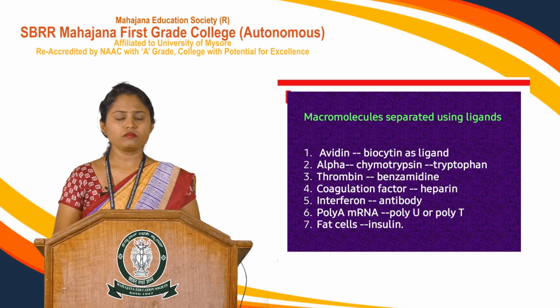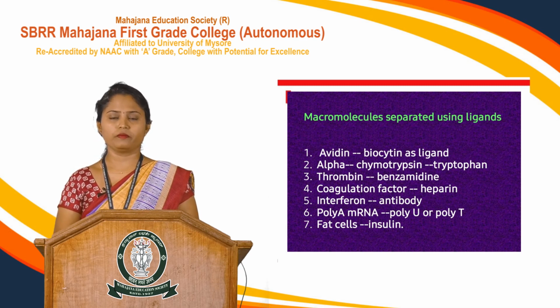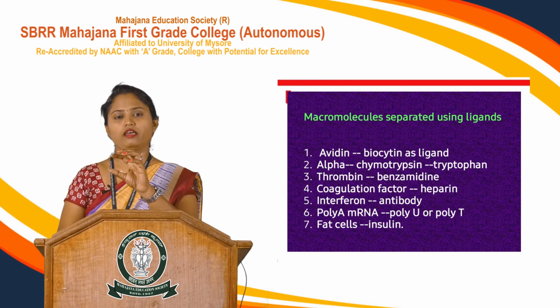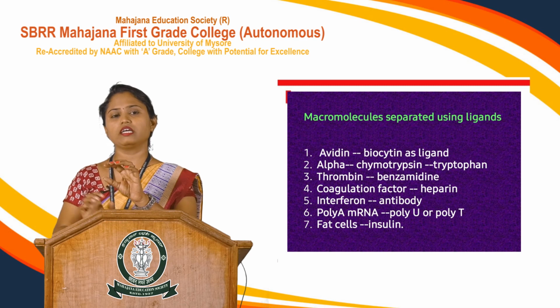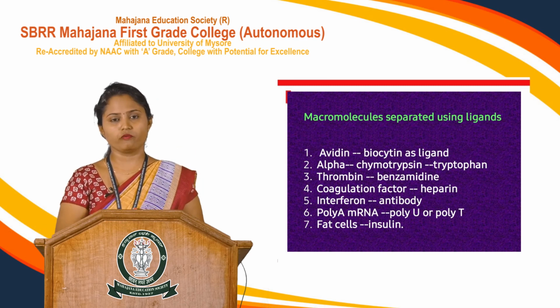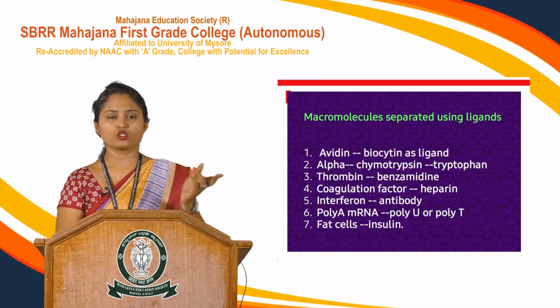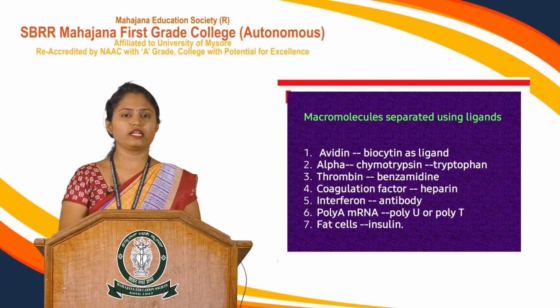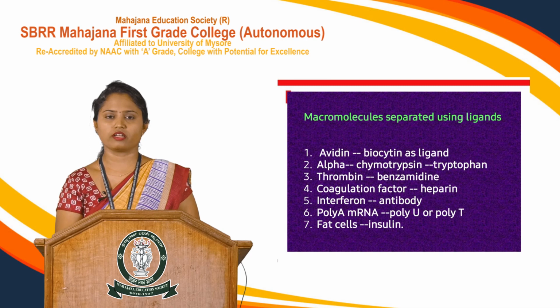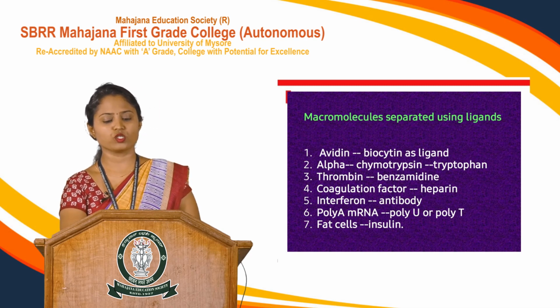So, you can fix the ligand as poly U or poly T and load the mixture of mRNA samples, wherein the poly A tail of the mRNA will target and bind by complementary base pairing with the complementary bases acting as the ligand. In such cases, you can isolate the mRNA from your mixture of nucleic acids or mixture of mRNAs. So, it is applicable not only to proteins but in all kinds of fields.